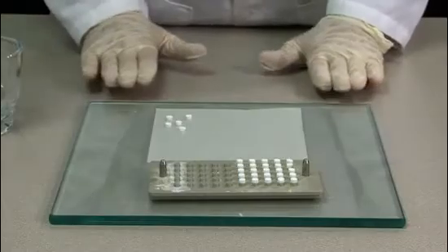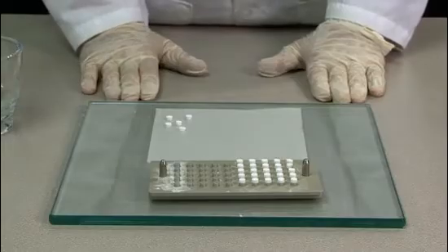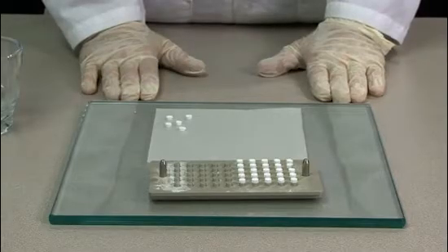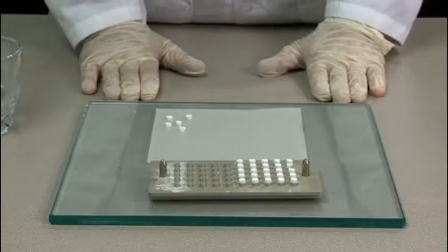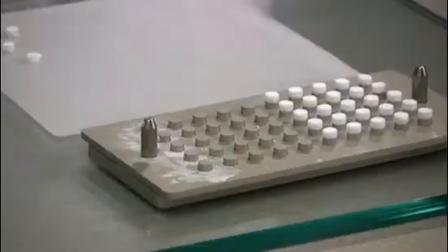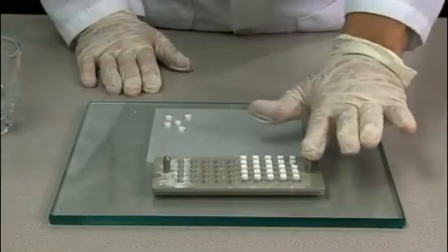The first thing that we need to do in making tablet triturates is that we need to calibrate the mold. If you will refer to the formulation record, you will see that calculations are needed to determine what percentage of a cavity is occupied by the active drug. The way that percentage becomes calculated is that you have to make two sets of tablets. One set of tablets is the drug alone and is shown as these 5 tablets here. The other set of tablets is made from the base alone, as shown by this section of tablets here.